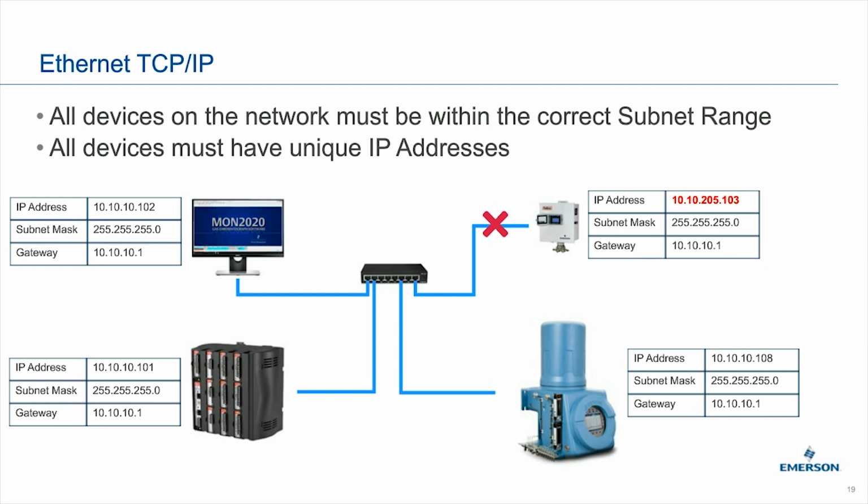I've got a point here. Someone's highlighted that with a 485 bus, it should be daisy chained. That's correct. They should all be connected in parallel. You can't do a star network where they all come out from the host. You really need to daisy chain them along, because otherwise a star network will cause you lots of communication issues.